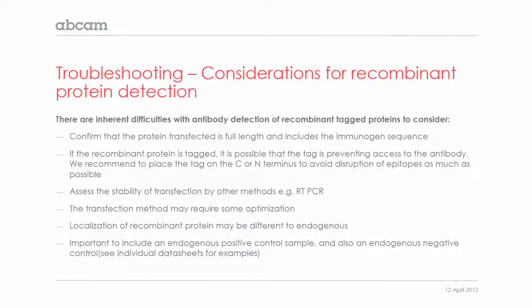You may want to assess the stability of transfection by other methods, for example by RT-PCR. You may find that your transfection method requires more optimization, so it's worth revisiting that. It's very important to include an endogenous positive control sample and an endogenous negative control — this will show you whether it's the transfection that's the problem. For examples of positive and negative controls, you can look at individual antibody data sheets.